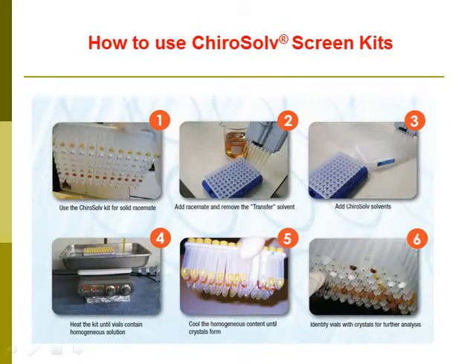How do you use the screen kits? You dissolve the racemate in a transfer solvent of your choice and dispense equal amount of the mixture into vials of the 4 kits using a multi-channel pipette. For plastic kits, 0.03 millimole of racemate per vial is needed. For glass kits, 0.001 millimole of racemate per vial is needed. Evaporate out the transfer solvent. Add the ChiroSolve solvents provided in a separate plate into the vials.